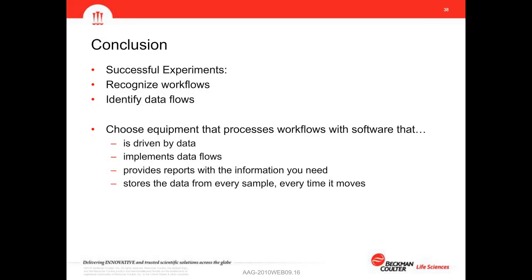So in successful experiments, recognize workflows, identify the data flows, and you want to make sure that when you're choosing equipment, you also have software that drives it, that can be driven by data, that implements these data workflows and provides reports with the information you need and stores data from every sample every time that it moves.